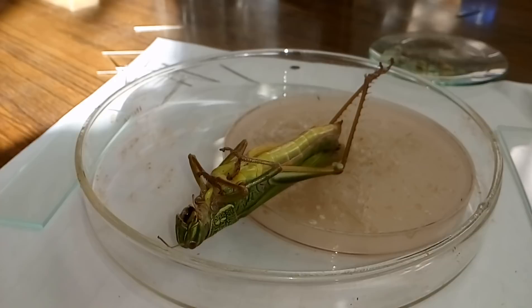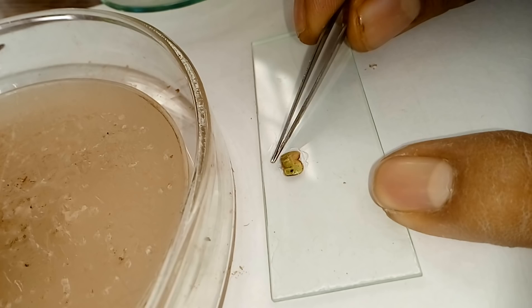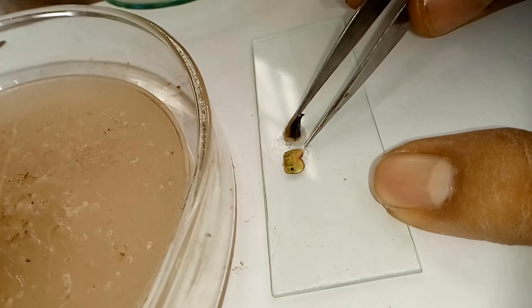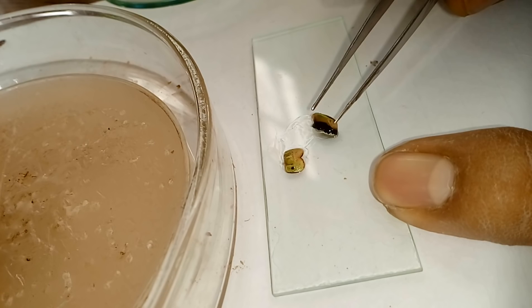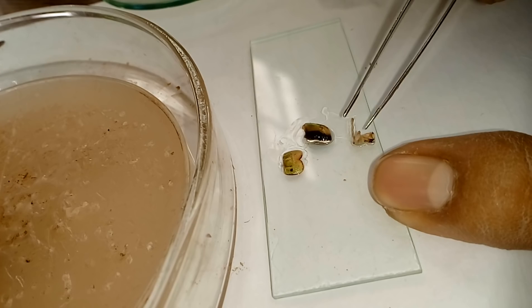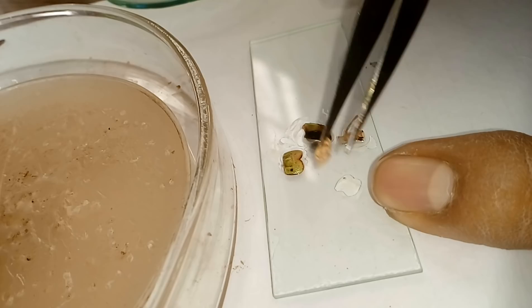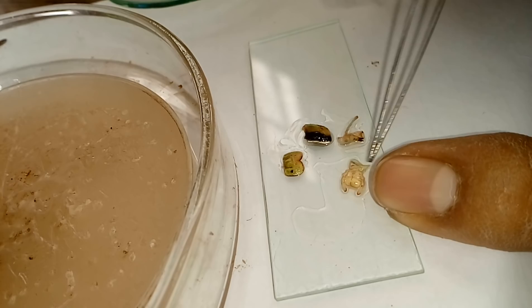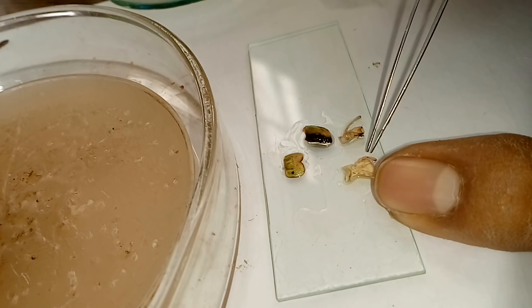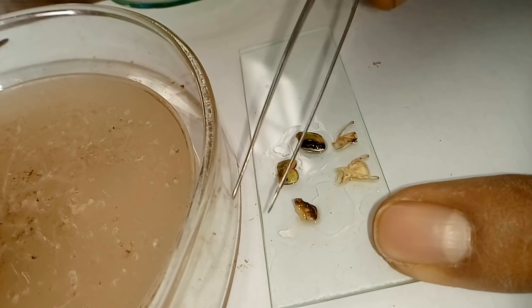Here on the slide — this is our upper lip, the labrum. This is our mandible of the left side. This is our maxilla with the maxillary palp — five-segmented maxillary palp. This is our labium — very clear. Not only are all parts visible, but for the study of the different segments of the labium — like mentum, pre-mentum, sub-mentum, glossa, paraglossa — this labium is very clear.